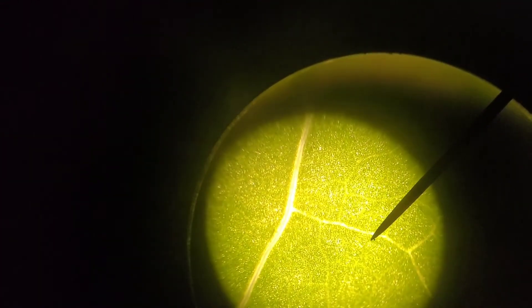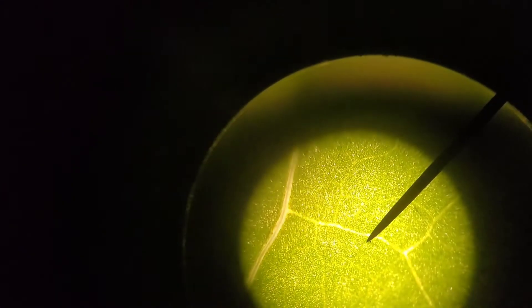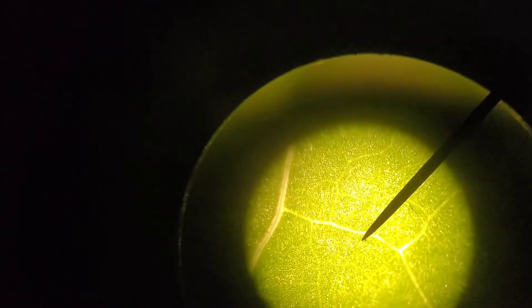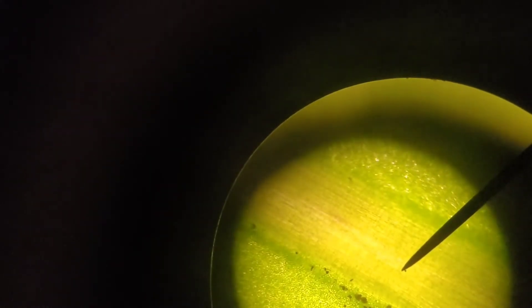Okay I tuned the microscope, here's the leaf. It's hard to film with the camera and my phone, but let me move it around a little. So here's the stem, you can see there's a little bit of debris over in the corner. There's a lot of fibers on the leaf.